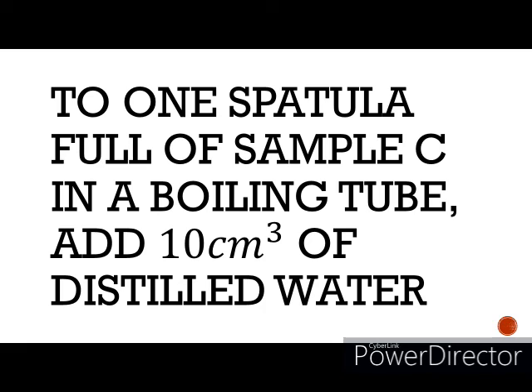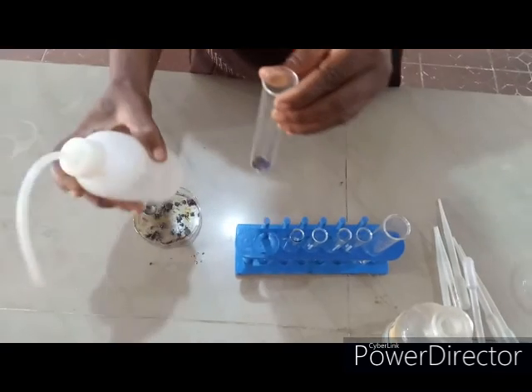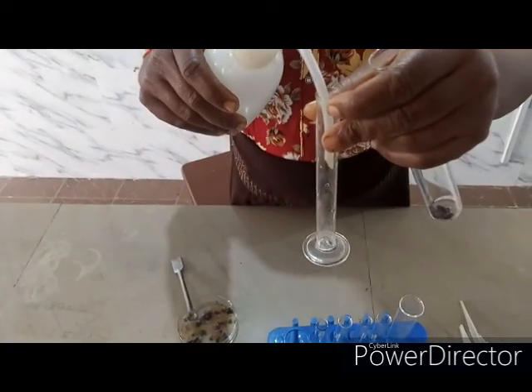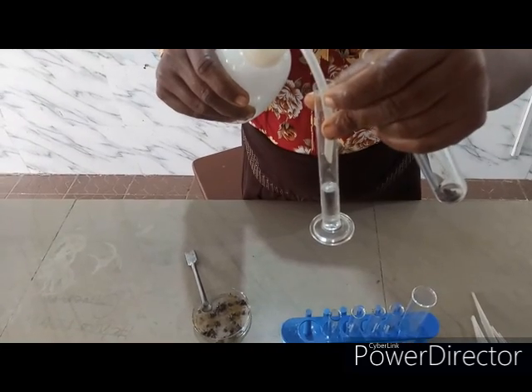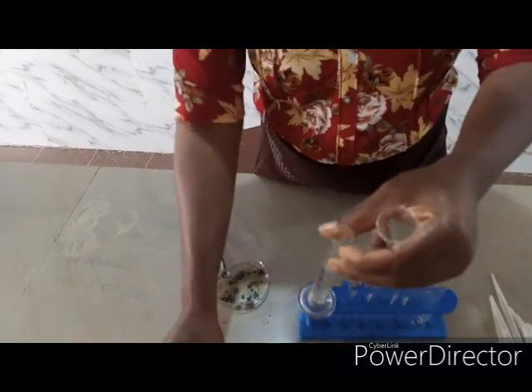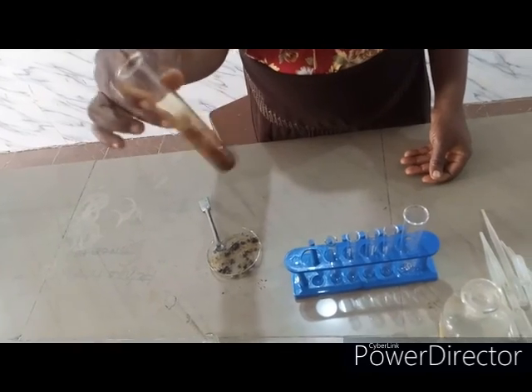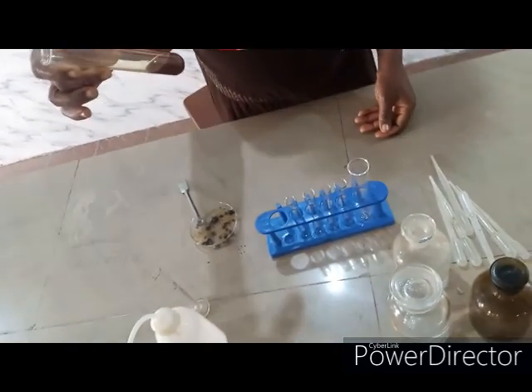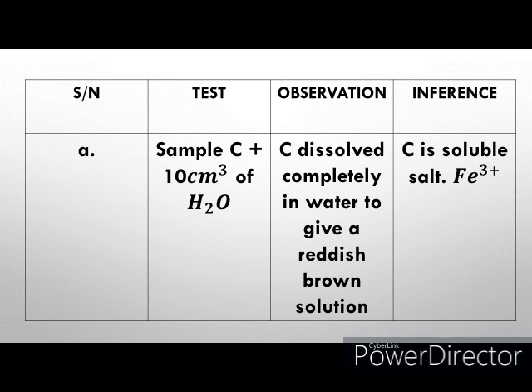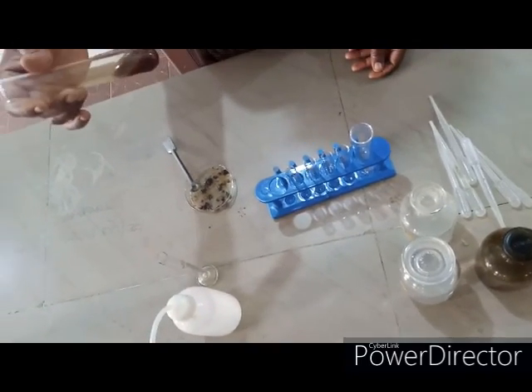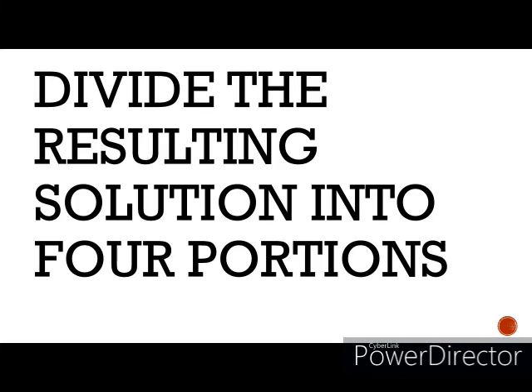Add one spatula full of the salt in a boiling tube. Add 10 cm cubed of water and shake thoroughly. As you are shaking the solution, you can notice that the salt is very soluble in water. The observation is that the salt dissolves in water to give a reddish brown solution. The inference is that the salt is a soluble salt and iron 3 plus is in solution.